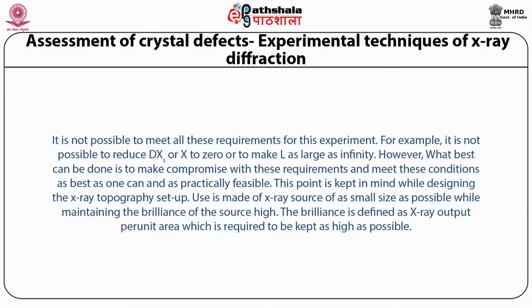However, what best can be done is to make compromise with these requirements and meet these conditions as best as one can and as practically feasible. This point is kept in mind while designing the X-ray topography setup. Use is made of an X-ray source of as small size as possible while maintaining the brilliance of the source high.